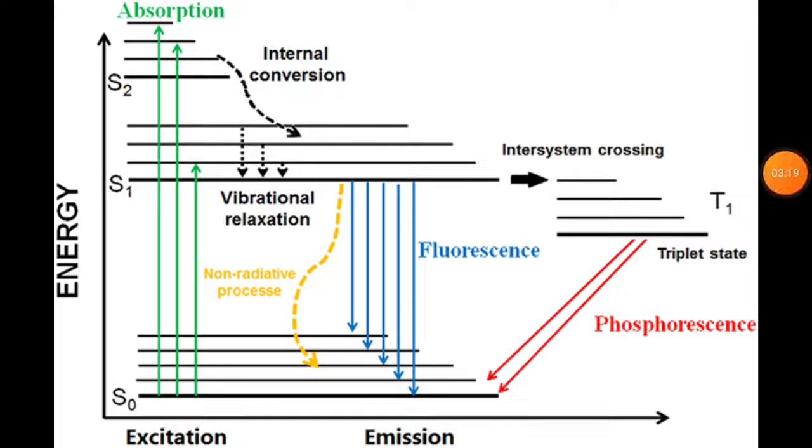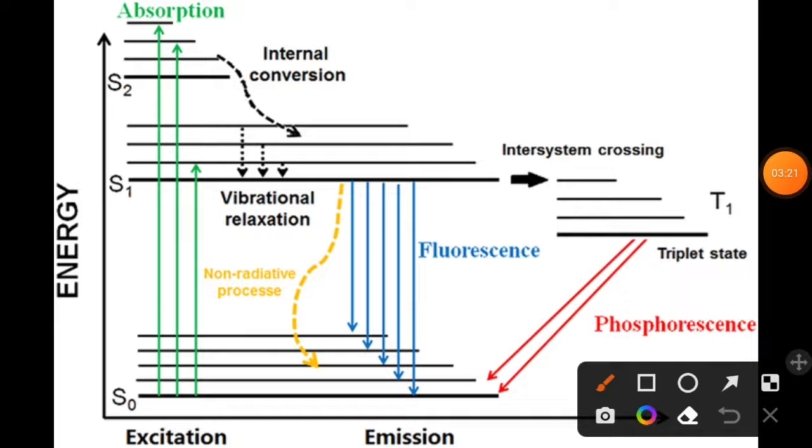Phase contrast microscopy solves every kind of problem, because although artifacts will be present, you can clearly distinguish that this is an artifact and this is my cell. So there is no problem.